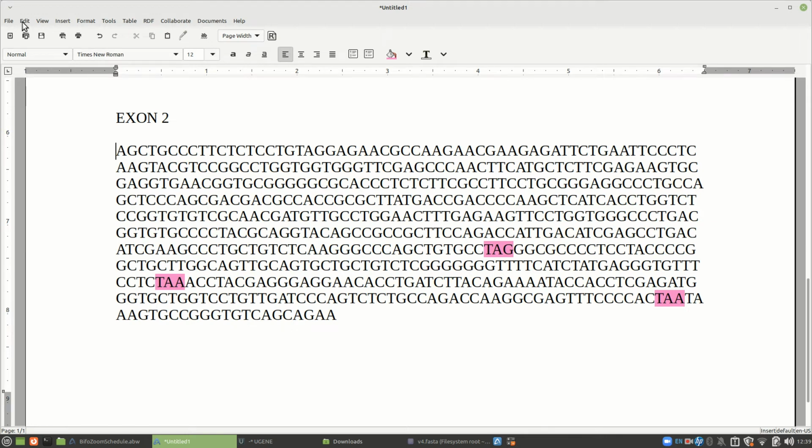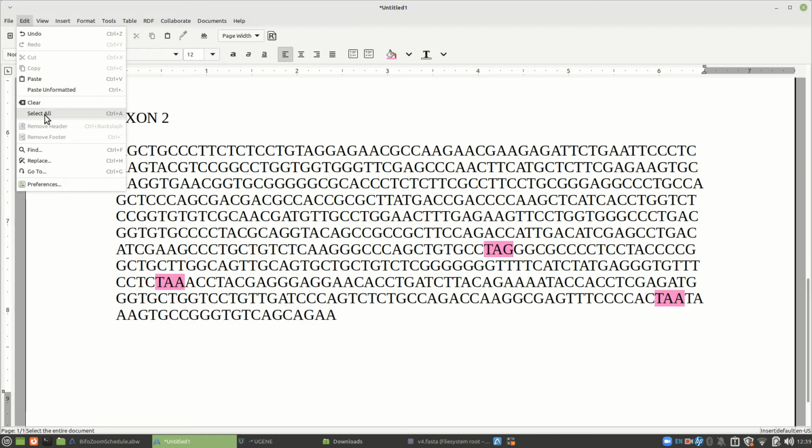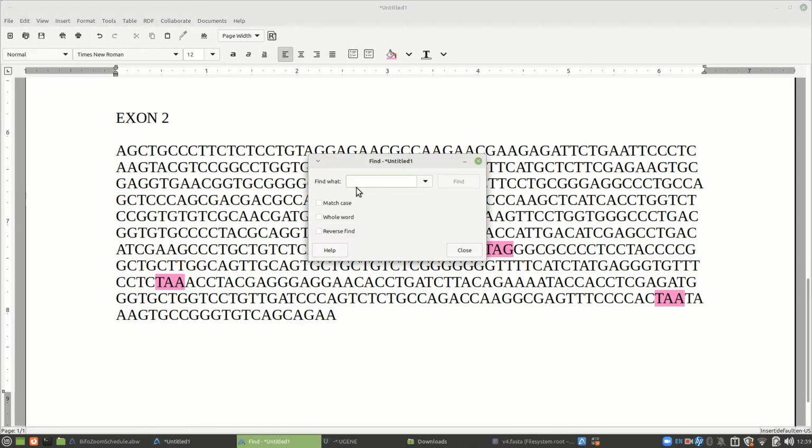But we're going to try and make some assumptions, and maybe that gets you in trouble, but I think I'm doing the right thing. TGA. All right, and I'm going to find. Still too early. I don't think that's it. Though, you know, if it is in the reading frame, as in 3333, it could be.